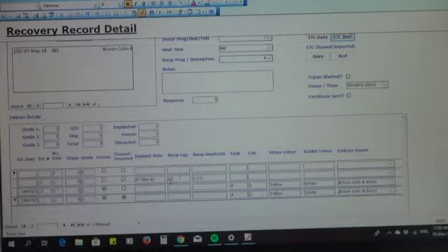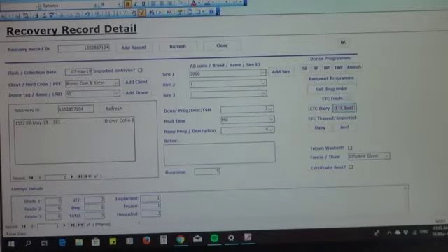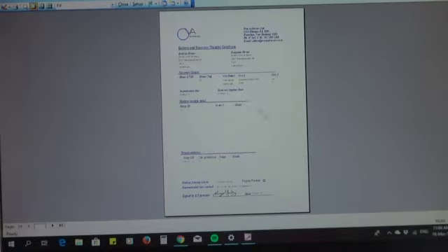So when we're out in the yards, he, on his telephone or his app, or my tablet, it could be any of those, he'd have this list here, and he would be able to enter recipient details and print off his own login and find his own certificate, so that he's always got a record of that.